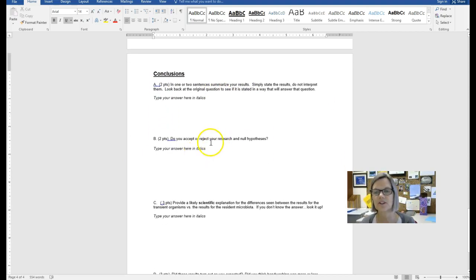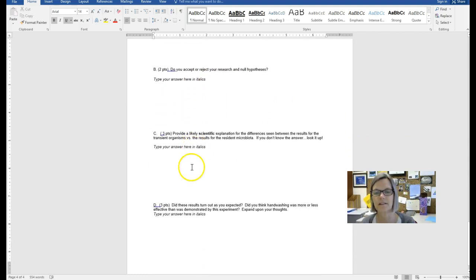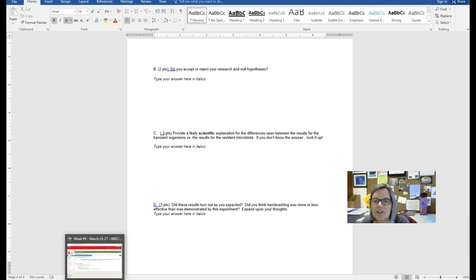Do you accept or reject your research and null hypotheses? Provide a likely scientific explanation. In your data, I think you're going to see a difference between residents and transients. So tell me why there's a difference. Give me a scientific explanation.